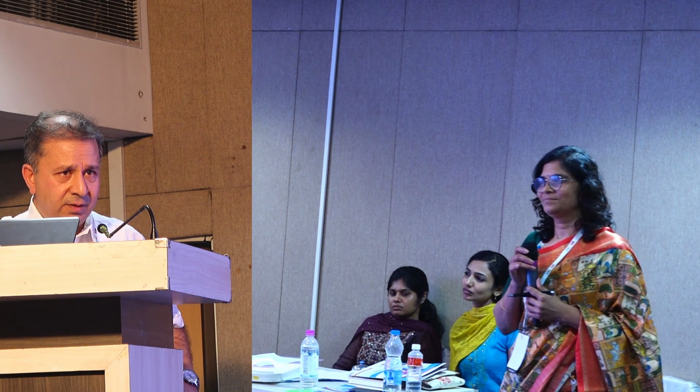How much extra time for dilution? You're doing it at the same time, sir. You're adding just one more tube, that's it. Like 3 more CDC tubes. CDC takes more time. CDC is 5.5 to 6 hours, flow is 4.5 hours. Less than that actually.